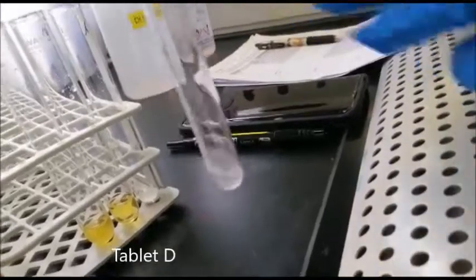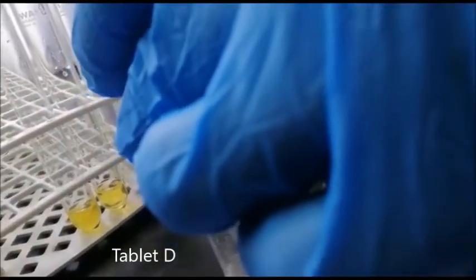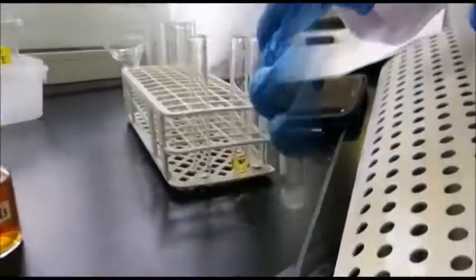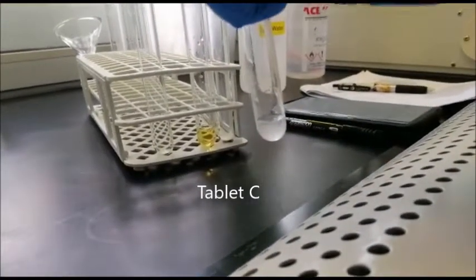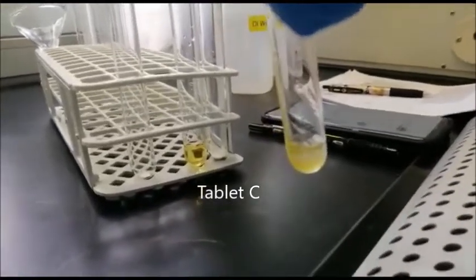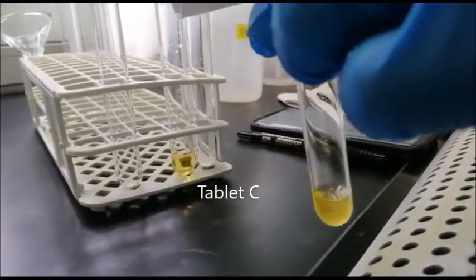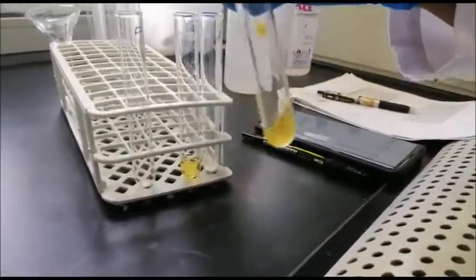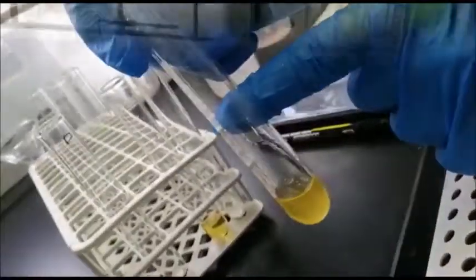We performed 4 main tests to determine the identities of the drugs provided. Each drug was ground up via mortar and pestle prior to each test so as to maximize surface area to volume ratio, allowing for a much faster and more noticeable reaction. The first reaction is with dilute ferric chloride solution.